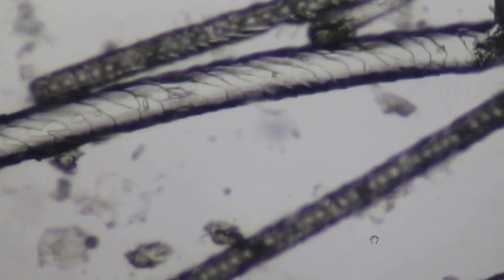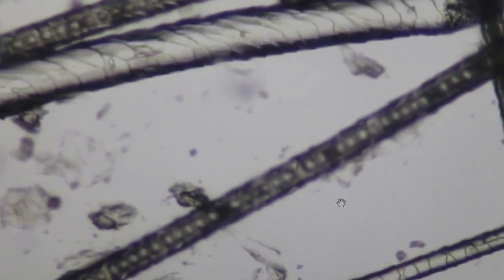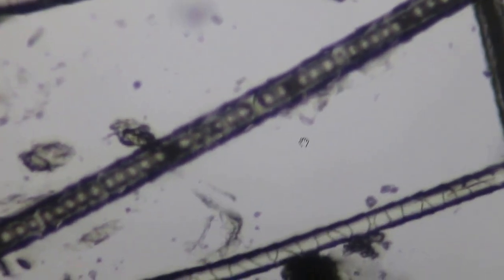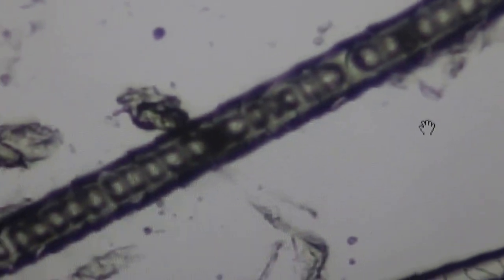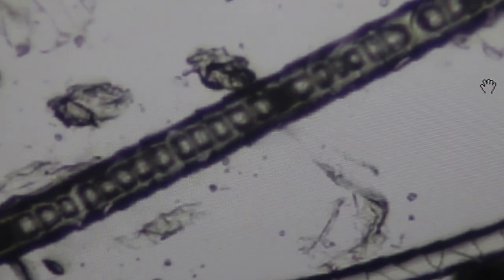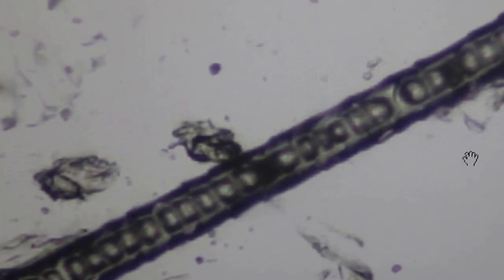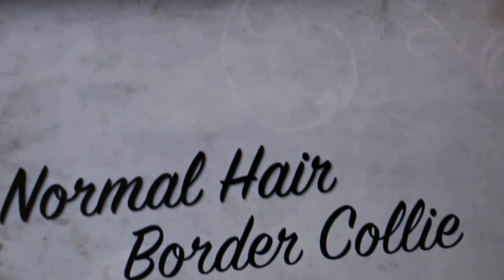Now the normal hair of the dog, or of this Pomeranian - in the medulla there's a lot of these segments. This is normal. If there's ringworm, you will see the rough areas. We'll show the normal hair first.